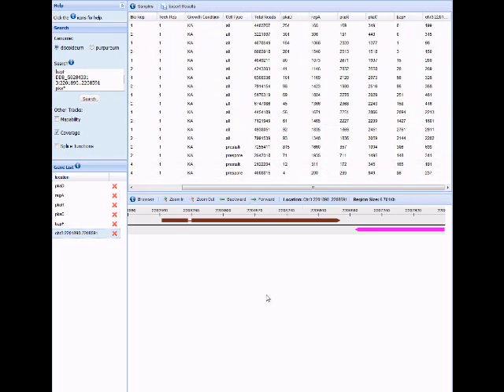The browser panel is updated to show the chromosome region of the last result, in this case chromosome 3. What you're looking at are two gene models within this region.